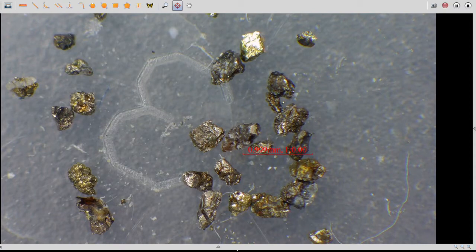You also put the whole material in a special container. We have to do it very carefully, as if we lose something, that would be a catastrophe. Okay, in these fractions there are a lot of sulfides, as they have a special grain size distribution in nature.